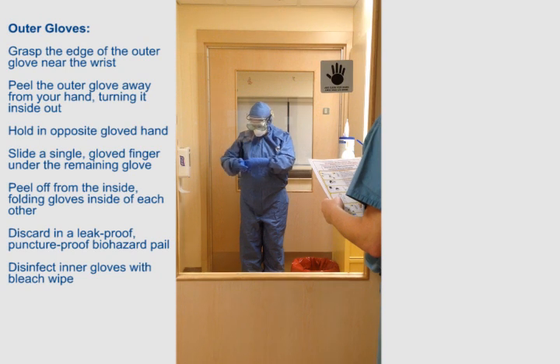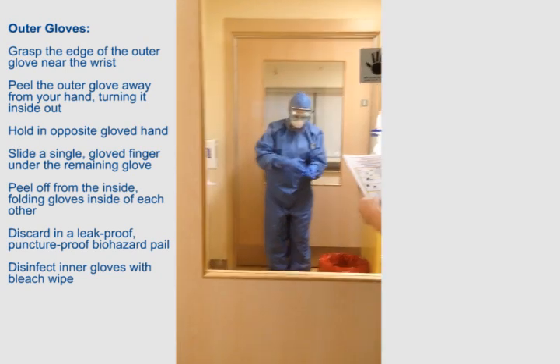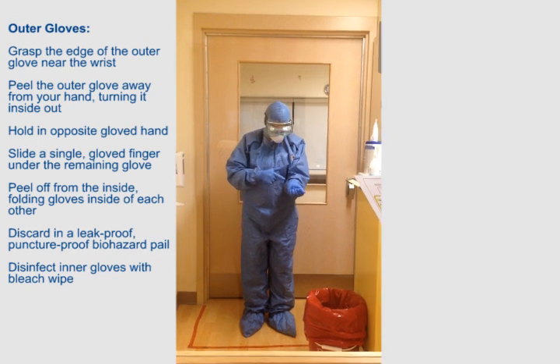Outer gloves. Grasp the outer edge of the glove near the wrist. Peel the outer glove away from your hand, turning it inside out. Hold in opposite gloved hand.